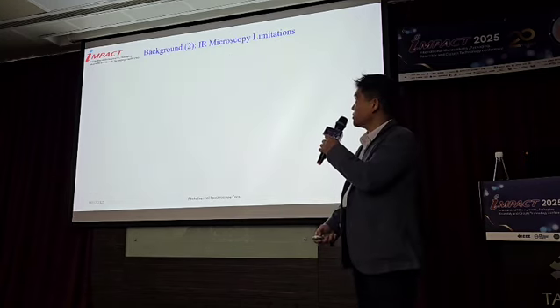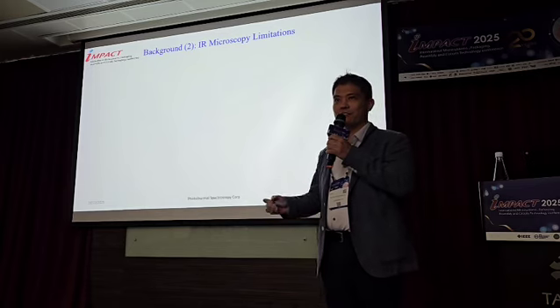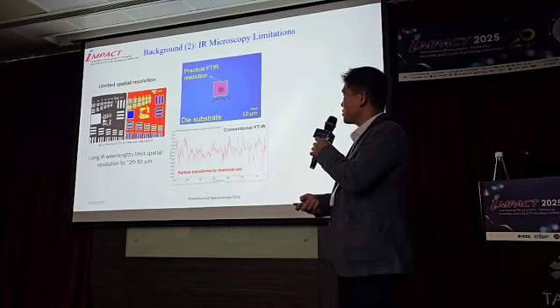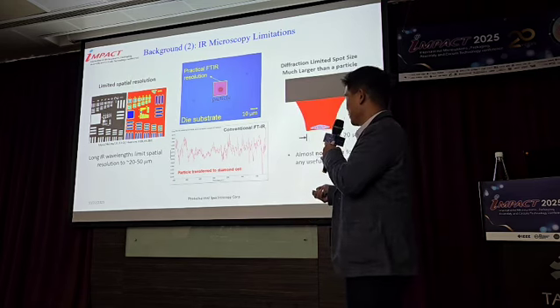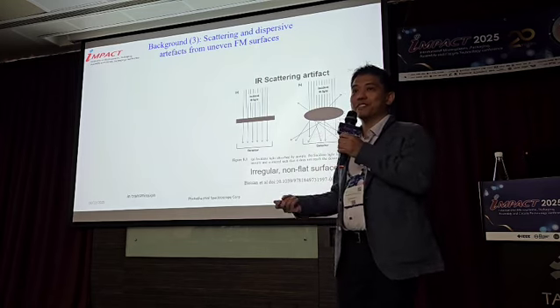All right, again, this is infrared, so we are looking at very long waves, 2.5 micron to 20 micron. Oftentimes when we have small particles like these, it's challenging to get useful information out of them. And it's not the only reason, really.